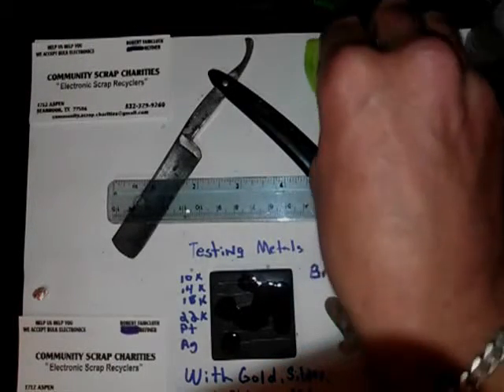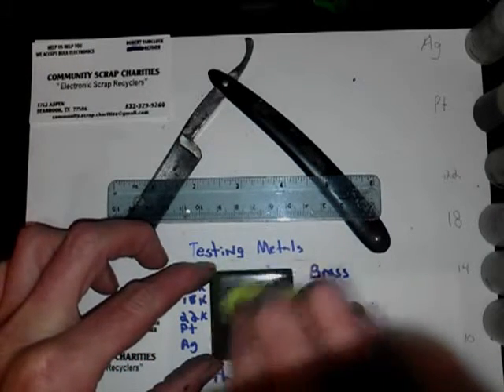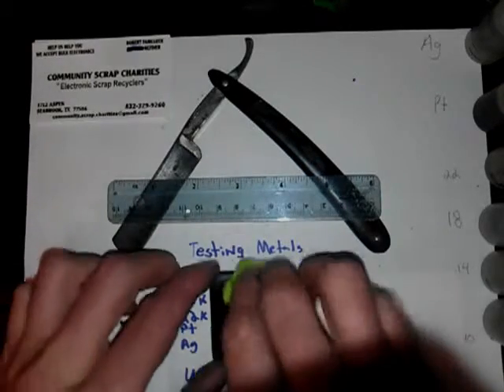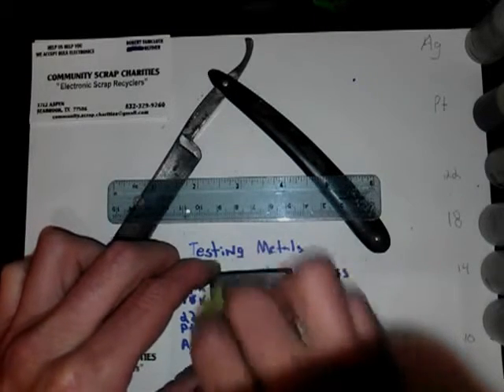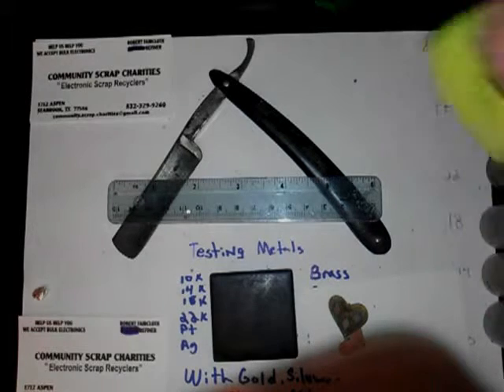So now we'll wipe this off and we will try a different metal. Always save your rags when you wipe off too, because you can always recover the values from them. So that was brass — let's move on to copper.